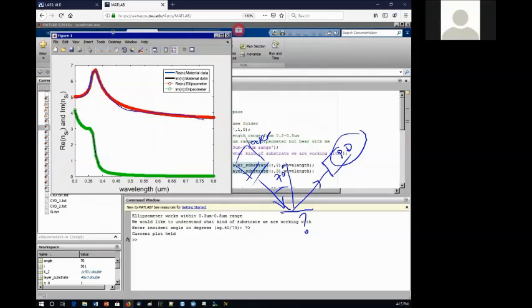And this is exactly what's happening. So I'm trying to tell you that ellipsometer is a good tool to get good optical measurements in terms of reflection, but it can also tell you what kind of a sample you're looking at. So this is the ellipsometer data, and this is the material data that you can find over the web. They're coinciding perfectly. This first proves that you're looking at silicon. That's good. You established what kind of substrate you're examining, okay?